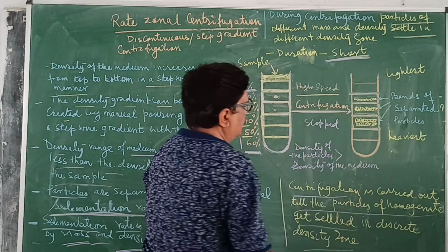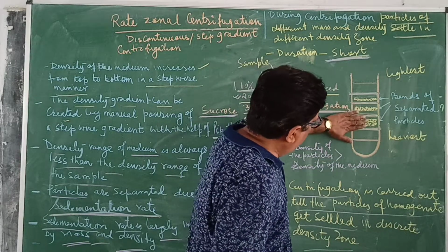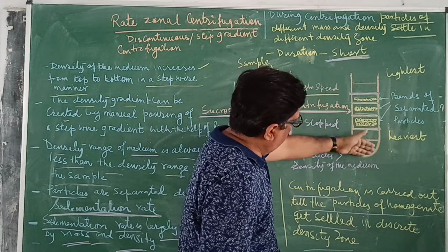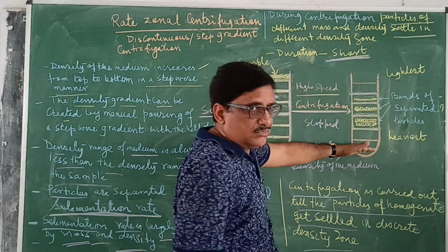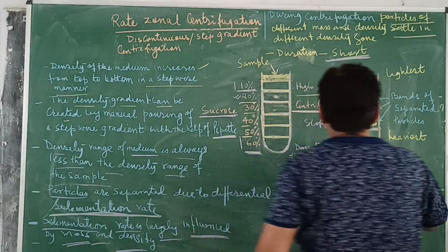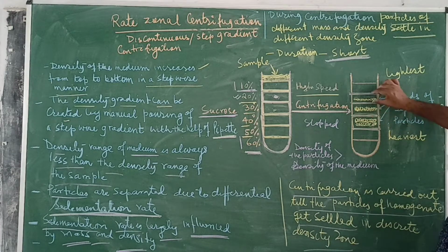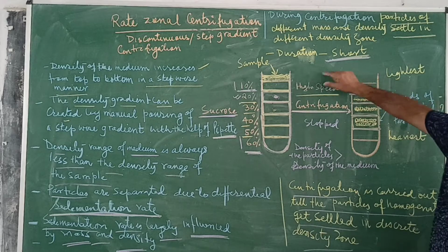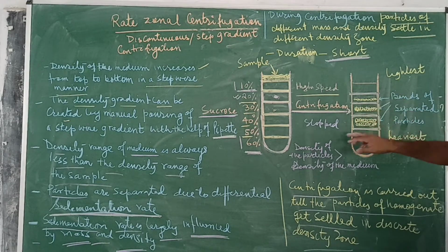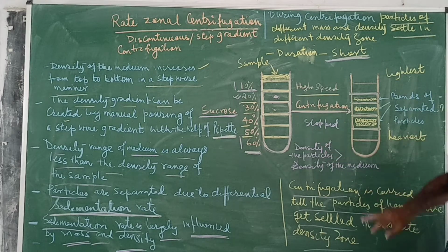Otherwise, because the particles are heavier than the medium, more and more particles will settle towards the bottom and the separation will be incomplete. Once the bands of different components are formed according to their mass and density, the centrifugation should be stopped.